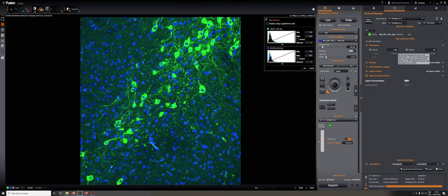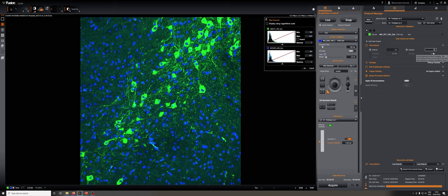So I'm going to do a five second interval, and I'm going to say I want to acquire 10 images.